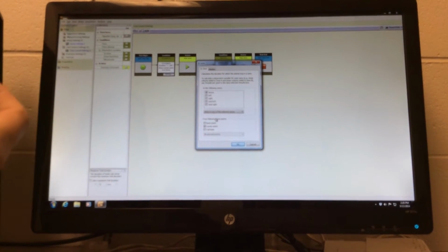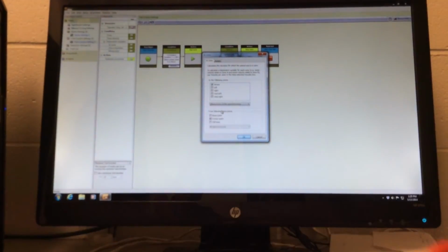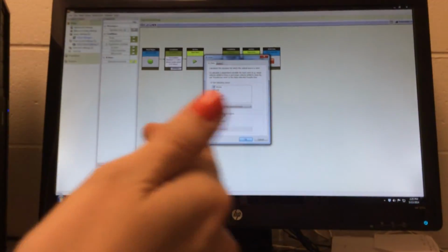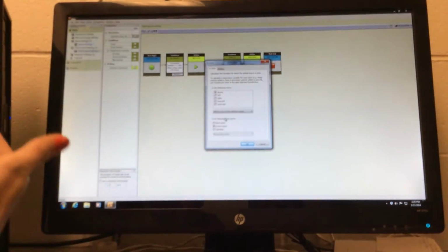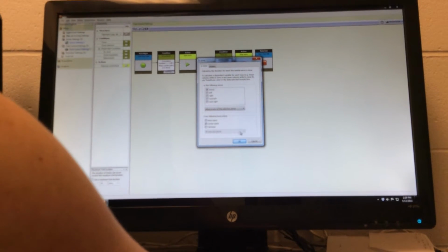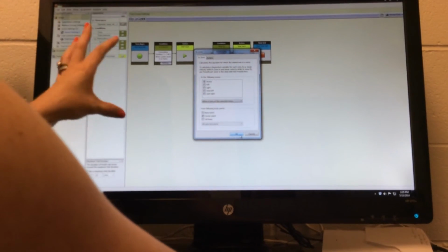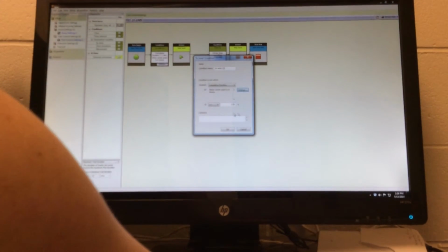So we have some people where, if the animal is starting in a hide box, they don't want it to start tracking until the animal comes out. So as soon as you see that nose, start tracking then, but we don't care about the rest of the time. So it's just up to you as to what your requirements are. But this is the basic one. Once you see it for 1 second or 2 seconds, start tracking.